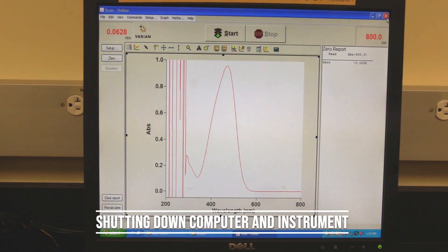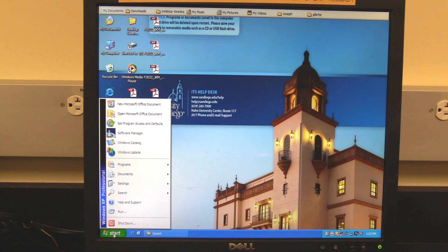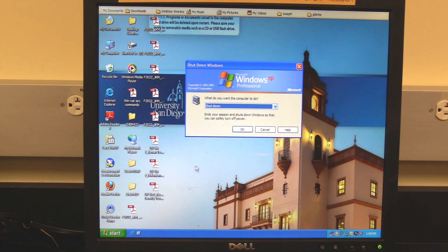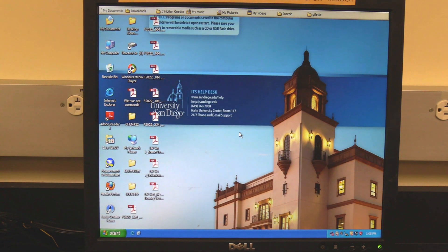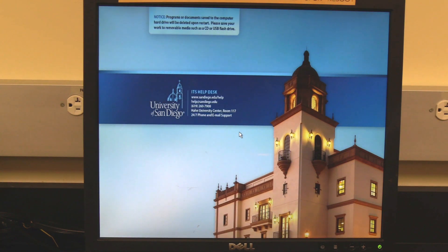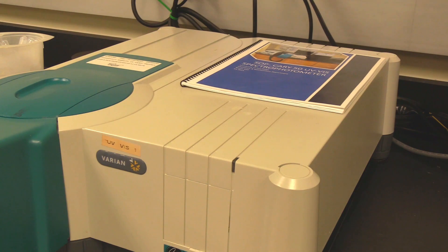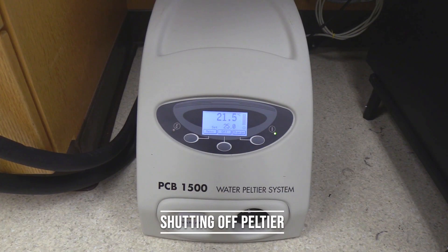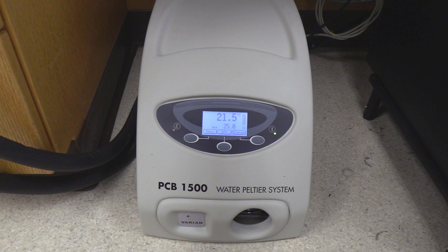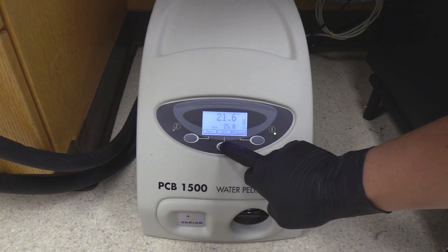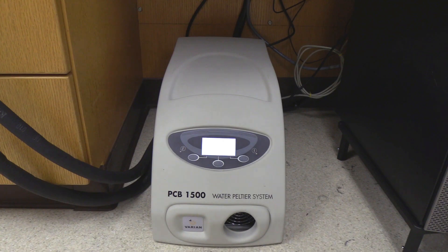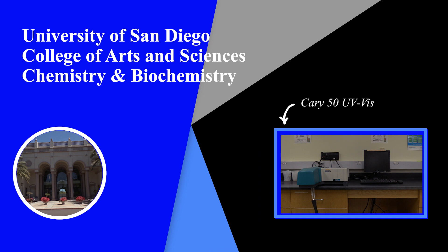Shutting down the computer and instrument: close the software and Cary Win UV folder, then shut down the computer. It is important the computer be shut down because the instrument is powered through the computer. The instrument power light should turn off. Turning off the Peltier: if the Peltier was used, press and hold the Center Off button until the Peltier goes into standby mode, then flip the power switch located on the rear left corner of the Peltier system. The instrument SOP should be located next to the instrument. If assistance is needed, please look in the instrument SOP for the contact information of the Scientific Instrument Specialist.